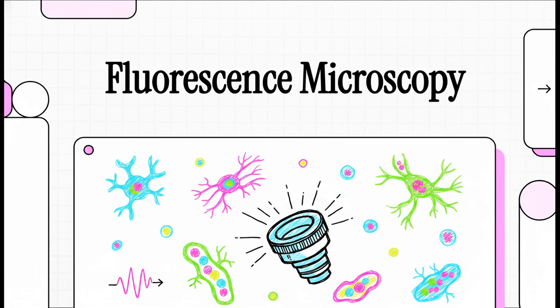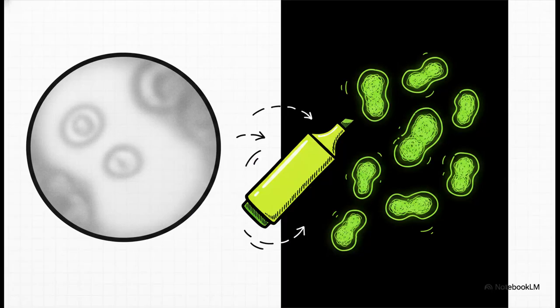Today in this explainer, we're unlocking the secrets of the brilliant and frankly fascinating world of fluorescence microscopy. The sheer visual poetry of this technique is just breathtaking. I mean, in traditional microscopy, looking at a cell can kind of feel a bit like staring through a foggy window. But fluorescence microscopy creates this definitive, striking contrast. By using highly specific reactive chemical stains, the unstained portions of a specimen simply vanish. They fade into this jet black background. And the targeted cells, they glow brilliantly. It's exactly like turning off all the lights in a dark room and finding exactly what you need with a glowing neon highlighter.